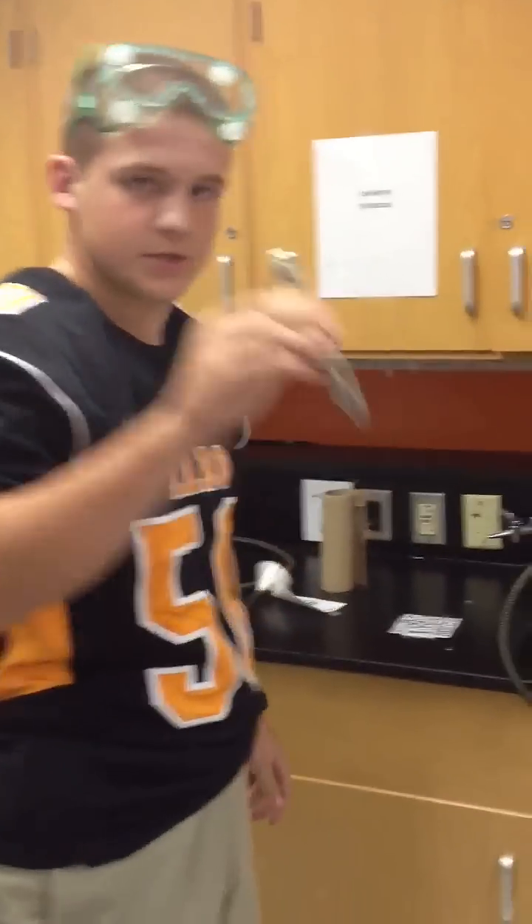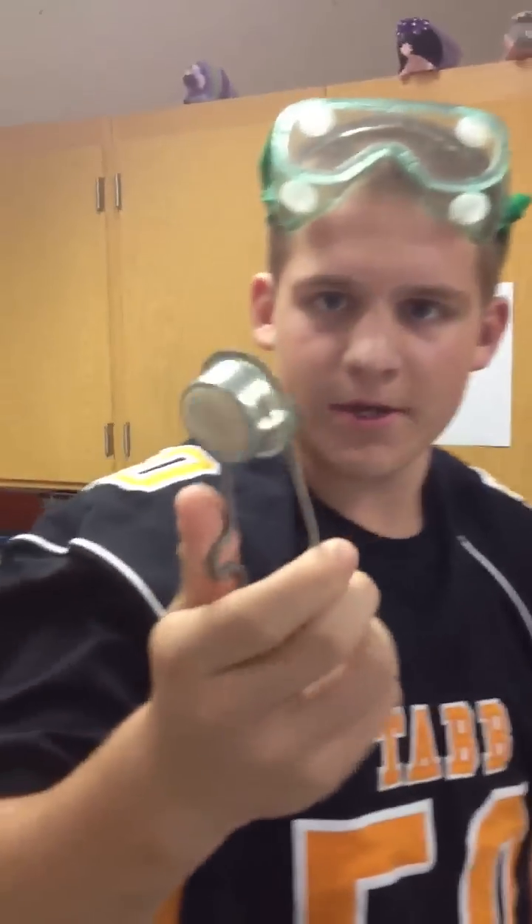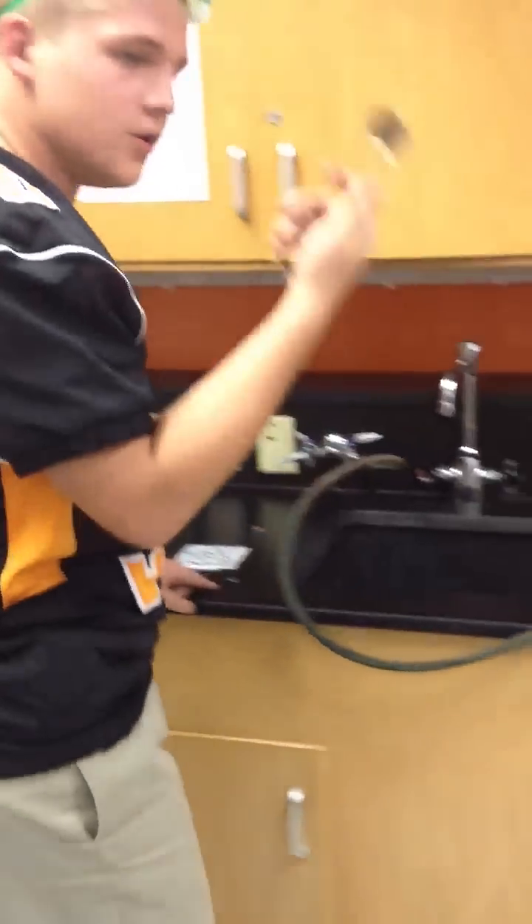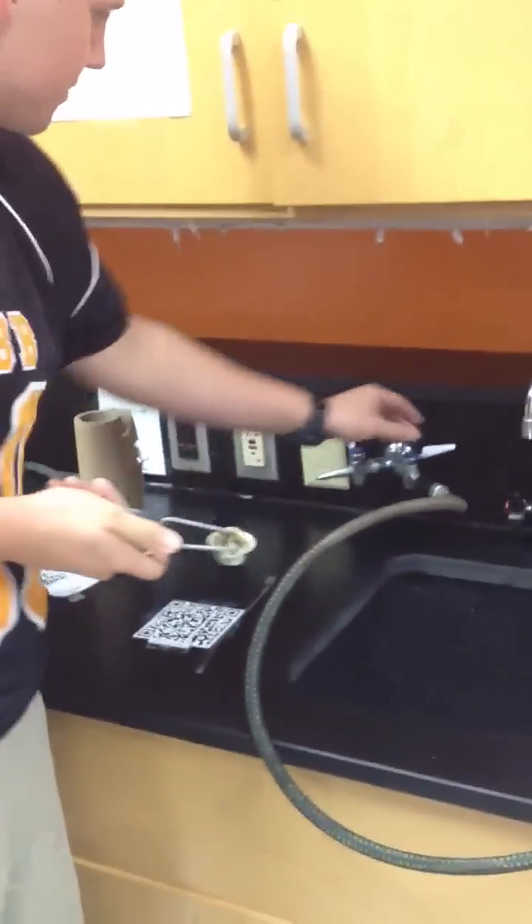All right, here we go. I'm going to show you all how to properly use this thing. This is a striker — basically basic flint and steel here. You can see that. I hope it's working. All right, you use this to light burners.